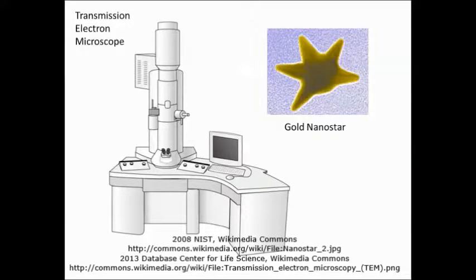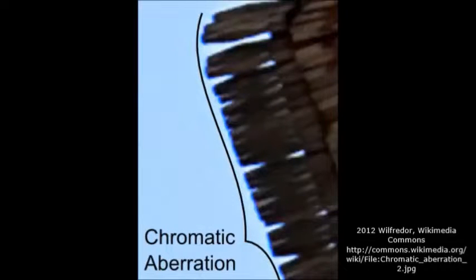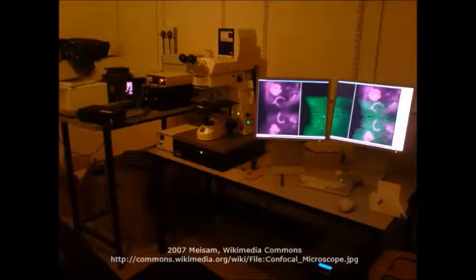While you can produce superior quality images, the resolution is still not equivalent to that of an electron microscope. The lenses can have chromatic and spherical aberrations, and you can have artifacts if the imaging is not done properly. This instrument also requires software and a computer to process the raster scanned images.